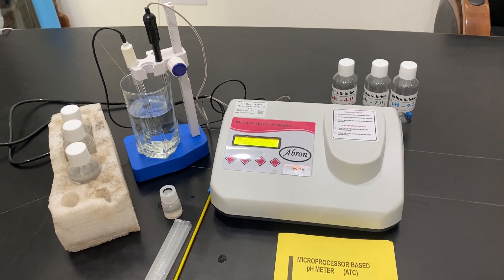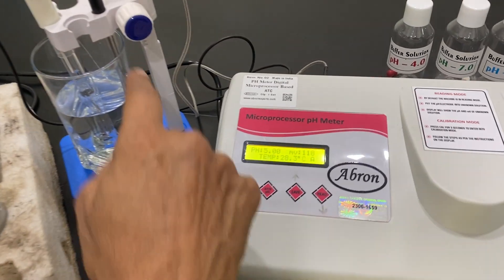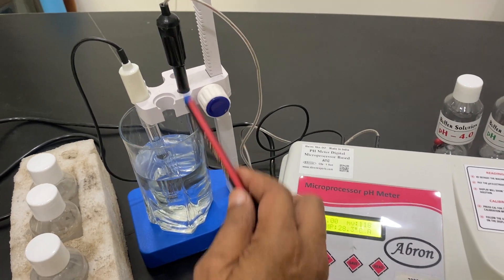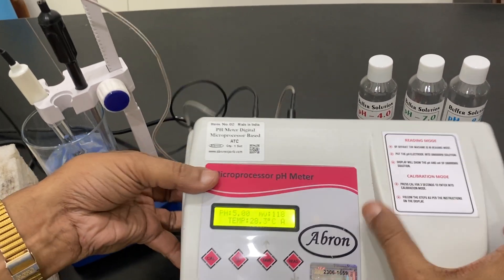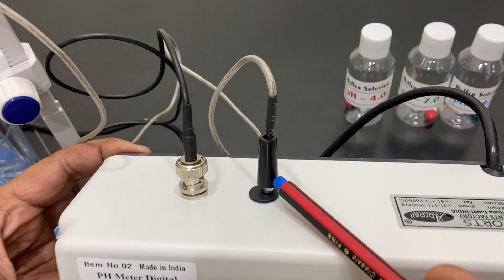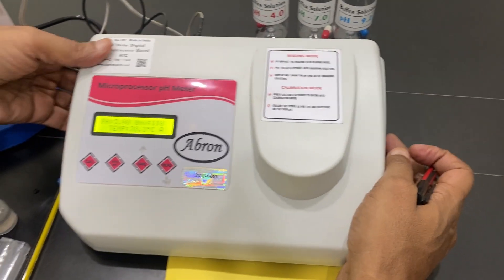This is a microprocessor-based pH meter with ATC, which means automatic temperature compensation. This one is a combined electrode. They are connected on the back side. There is a temperature probe and a combined electrode. One switch is there.